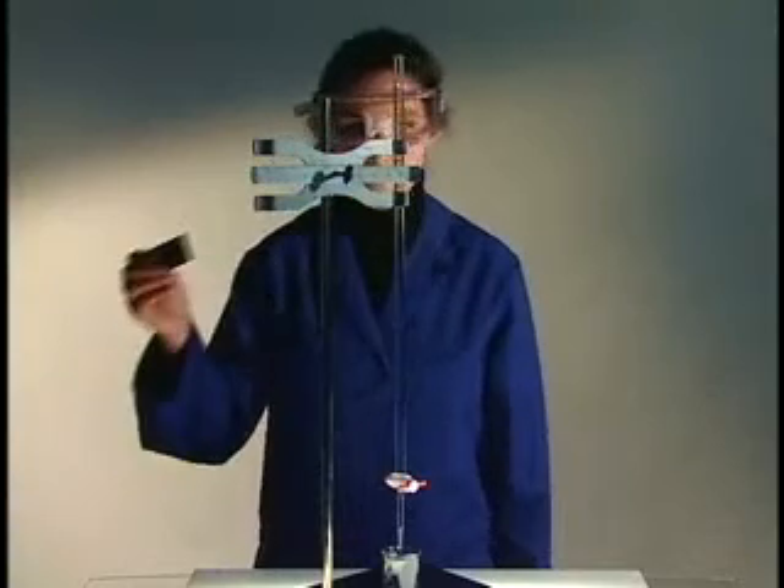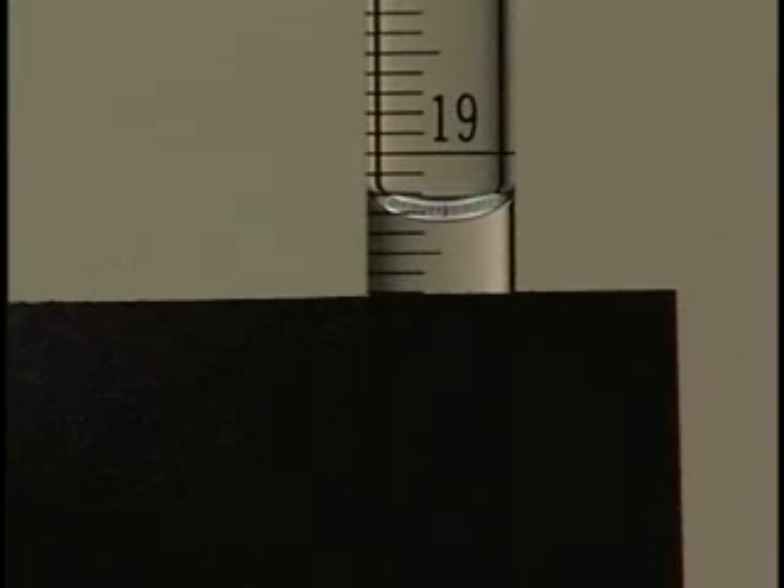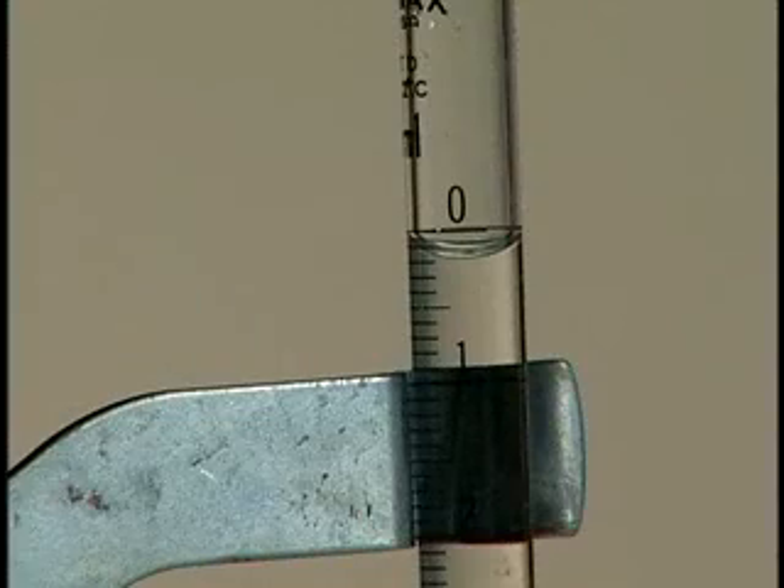If the meniscus is difficult to see, place a black piece of paper directly behind and slightly below the meniscus. This technique will darken the meniscus and enhance its visibility. The amount of solution delivered by a burette is the difference between the final and initial volumes of solution.